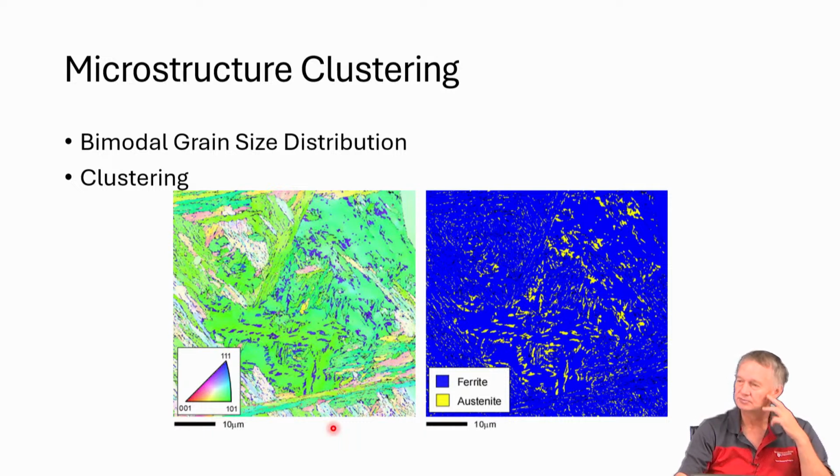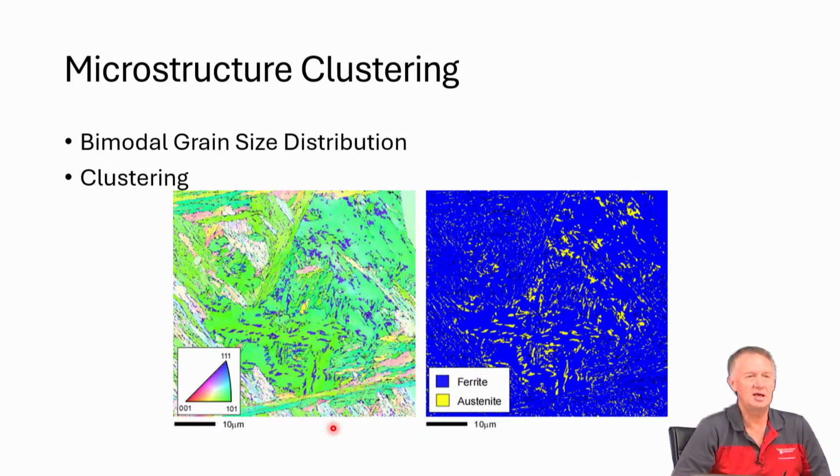So is it like that because a long time back I tried to do this and I was unable to do it, even though the pattern quality was great. Is it that there are changes in the software for capturing the EBSD patterns, so now we can do it much more easily and earlier we could not? All right, so the question is about in the past, he's had experience where you couldn't distinguish well between ferrite and austenite using EBSD.